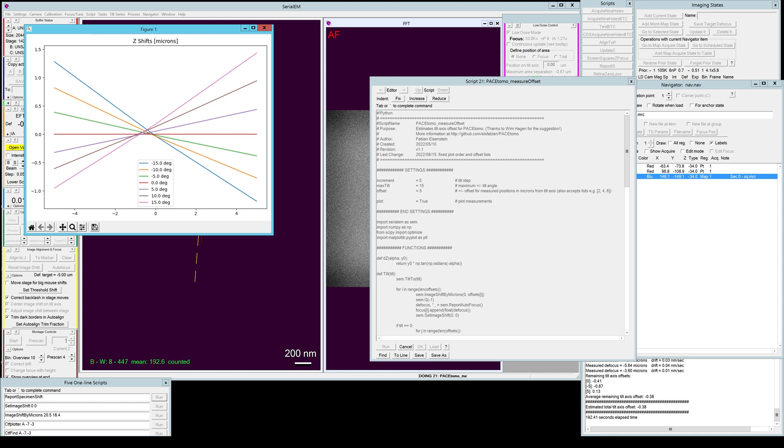This is accurate to about 0.1 microns. So what you can do if you still find a focus slope after collecting a PACE TOMO run, you can run GCTF or CTF find or whatever you prefer on your tilt series and plot the focus against the tilt angle.